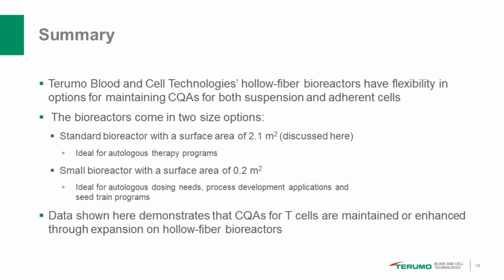Our next question is, how do you get the cells out of the bioreactor? There is a harvest procedure that we employ. We have either preset computer programs or you can design your own on Quantum. I didn't get into some of the technical pieces of how you operate it from a computer point of view, but you have a program that harvests, which governs the harvesting of cells.